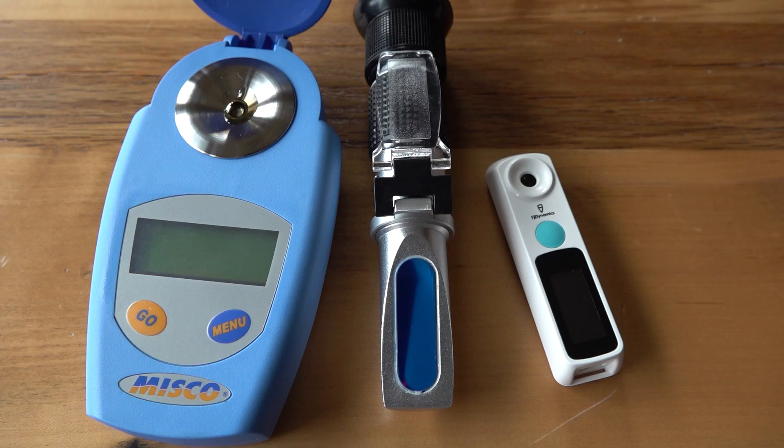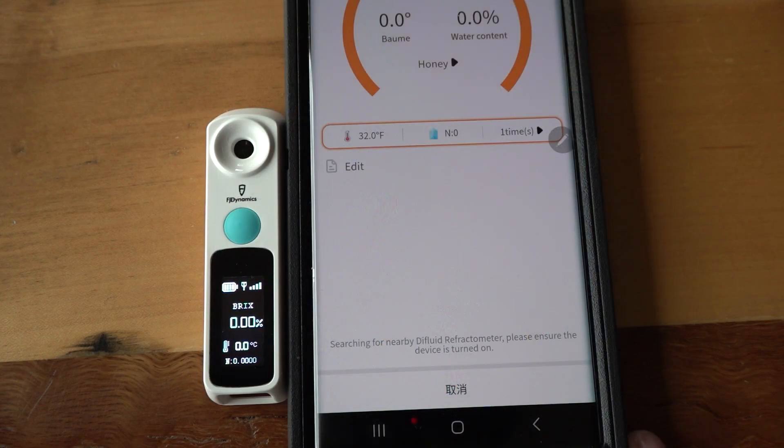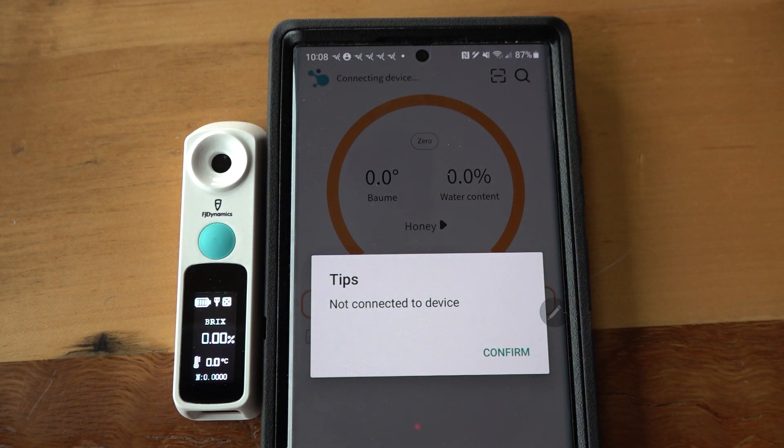So we have three refractometers side by side. It might not be fair to give the FJ Dynamics unit just one chance, so let's try again. Look at the top of the app — it says 'connecting device.' This thing loses connection with the refractometer frequently. I have to hit the search button on the top right so it searches for the unit. Make sure the unit's on. I also want you to notice the temperature is showing 32 degrees Fahrenheit — it was bouncing from the 60s and 70s down to 32°F, which is very interesting.